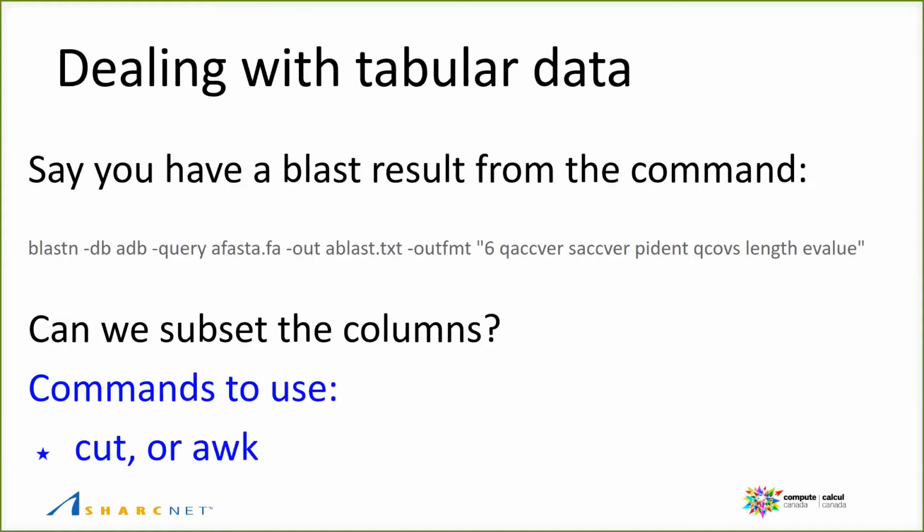All right, so let's start with dealing with tabular data. I'm just going to show you a few things that sometimes you wanted to know and didn't know how to do in the terminal, because you can do this in Excel or whatever, but that requires that you have a graphical user interface, et cetera.